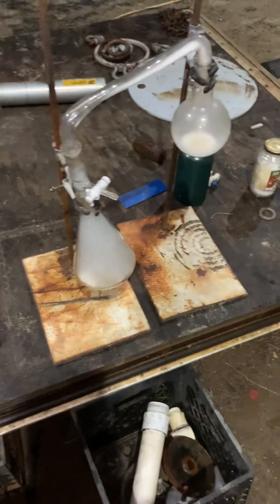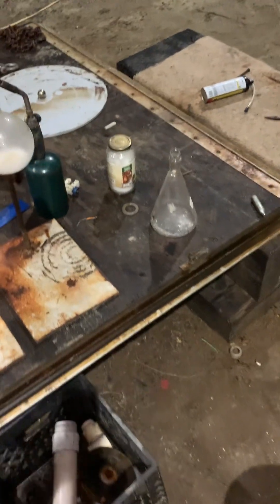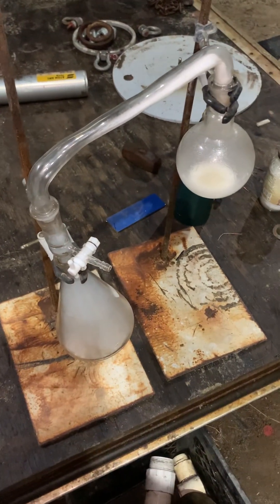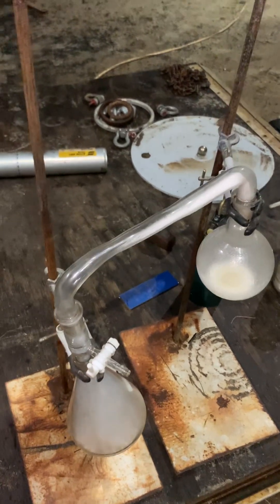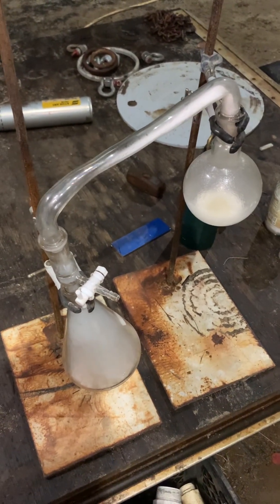If you go look up sulfamic acid, it'll say that it decomposes to water, sulfur trioxide, sulfur dioxide, and nitrogen. So you would think that the water would react with the sulfur trioxide immediately and cancel it out — just make sulfuric acid. But I didn't observe any water in any of this. So, yeah, pretty neat.